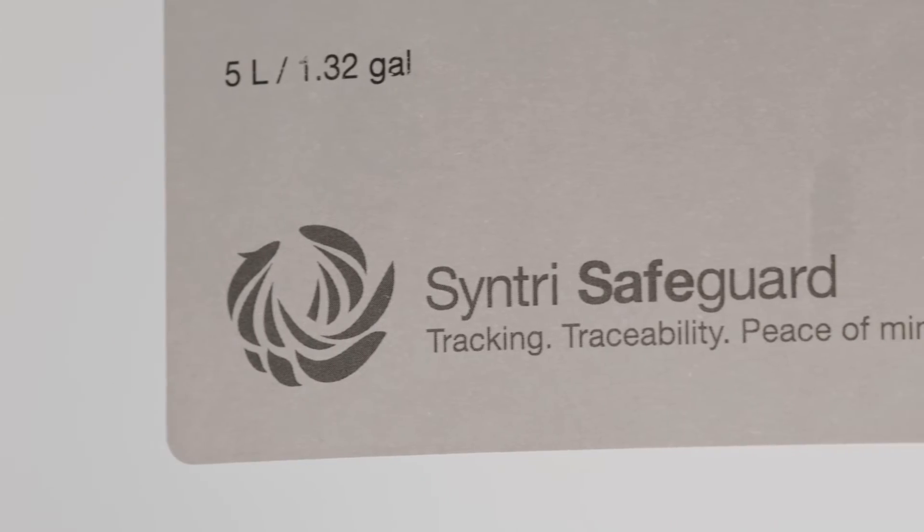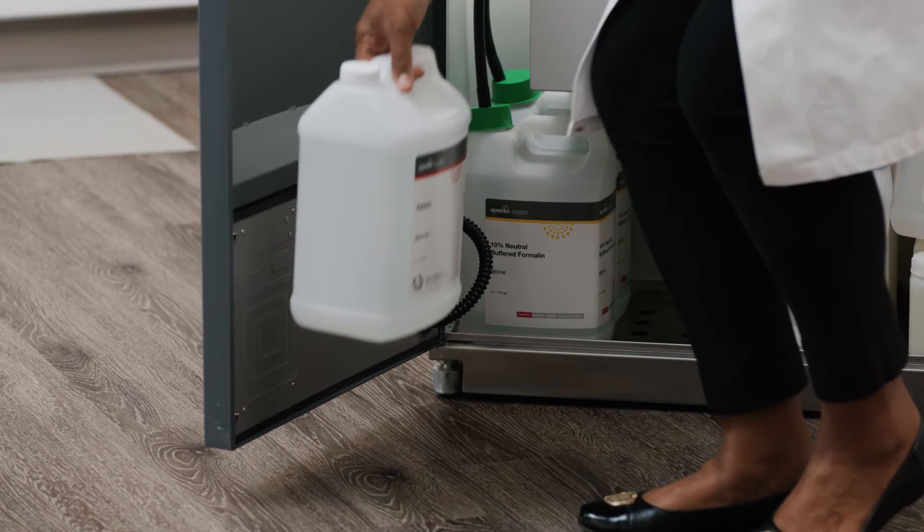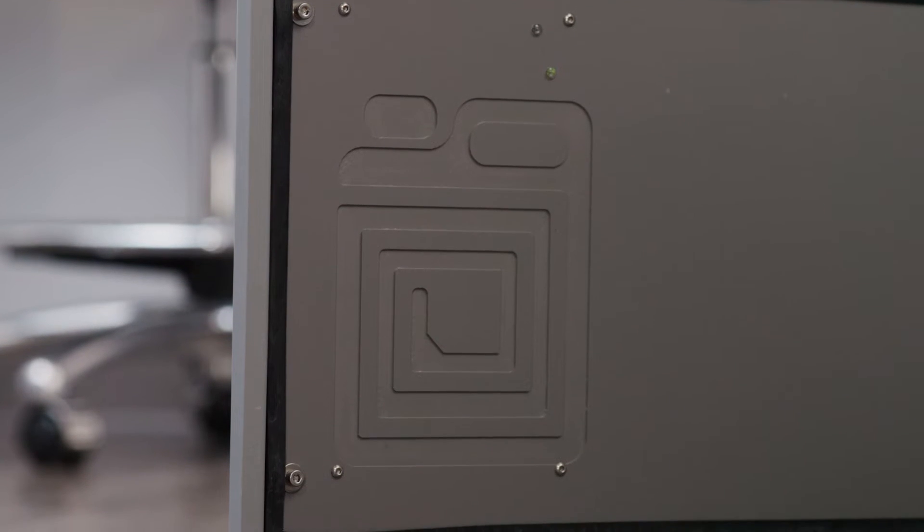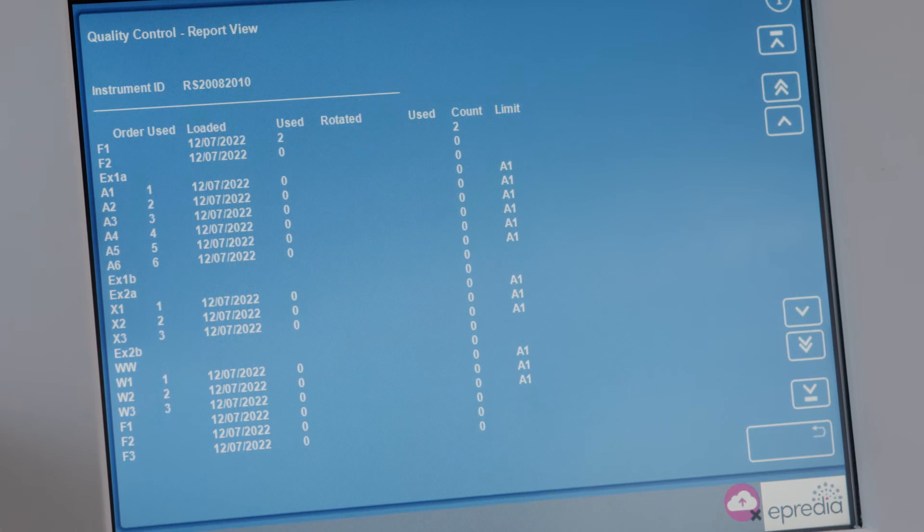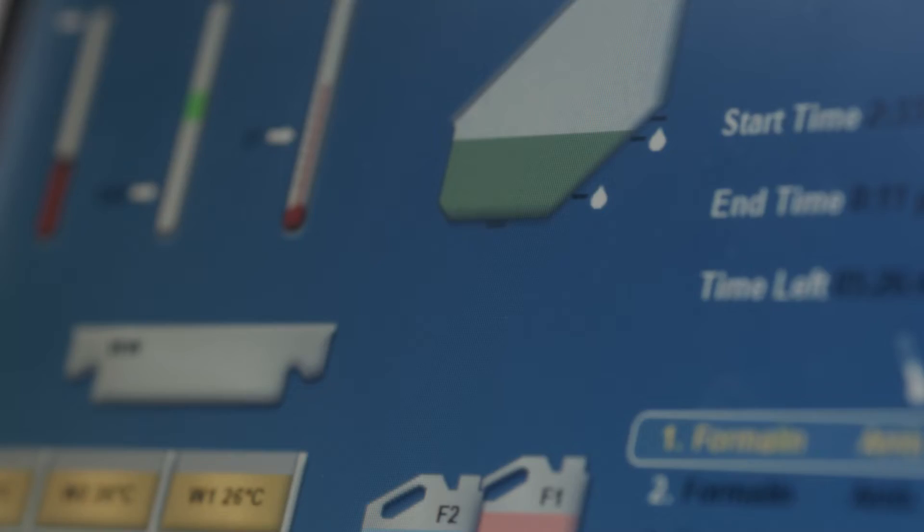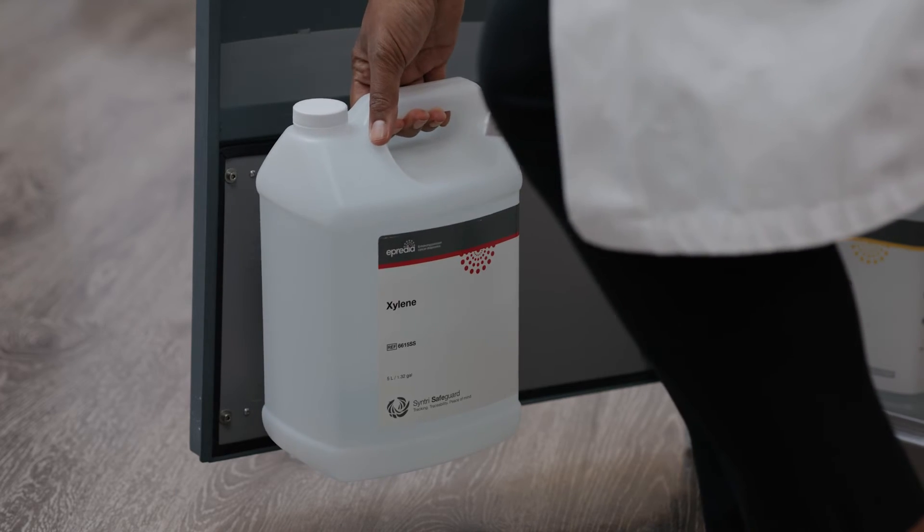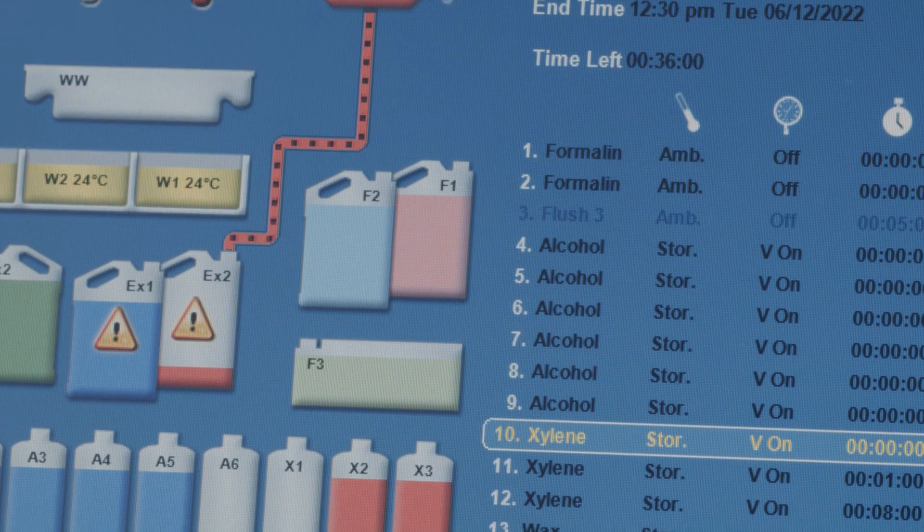When paired with proprietary Epredia RFID Syntri Safeguard reagents, the Revos system tracks and logs reagent exchanges. Syntri Safeguard technology ensures that the correct reagents are exchanged and creates an exchange log, documenting the reagent type, lot number, and expiration date. The Revos system helps ensure proper reagent replenishment, tracking every bottle loaded, protocol executed, and service performed for operational excellence.